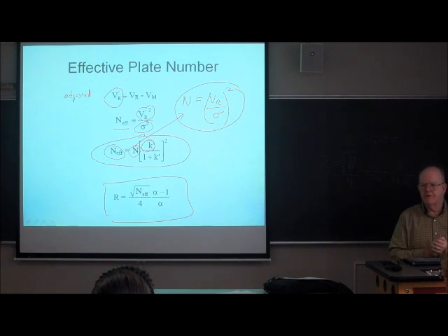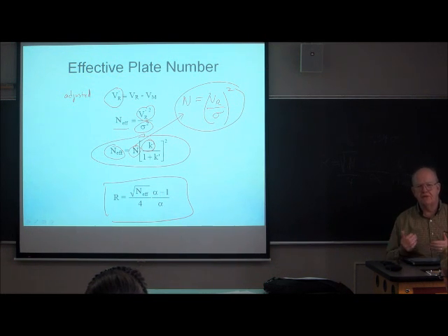They have different plate counts, but the amount of stationary phase that you can put in a partially porous particle is a good deal less than the amount you can put in a fully porous particle. So how can I compare these legitimately? You can make a good argument that what you should be using is the effective plate count because it compensates for differences in retention factors.